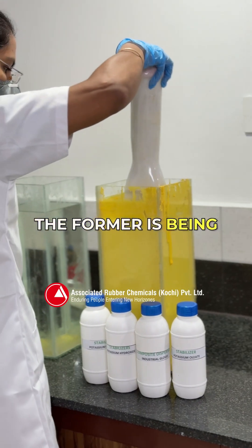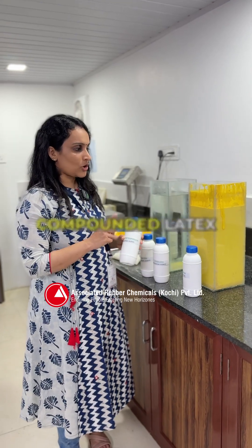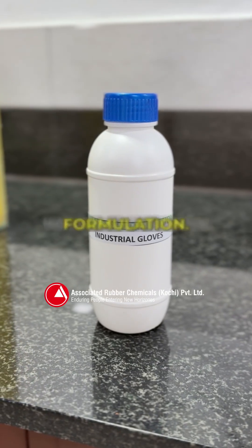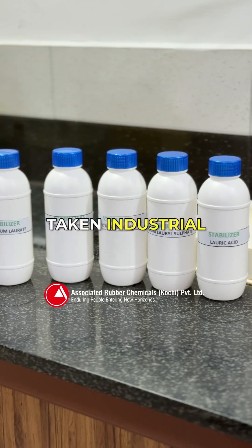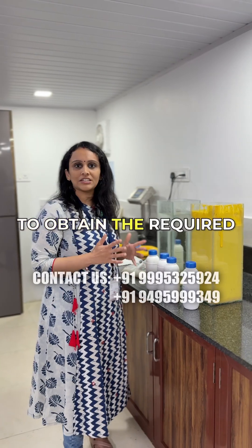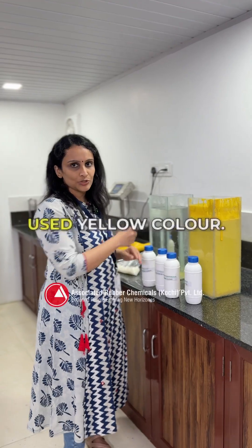Next the former is being dipped into the compounded latex. Here we have prepared the compounded latex using a latex composite dispersion which is our own formulation, and we have taken industrial gloves formulation with stabilizers as well. To obtain the required color, add the pigments accordingly — here we have used yellow color.